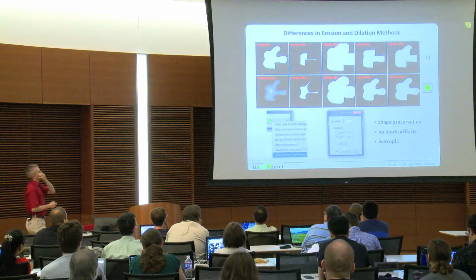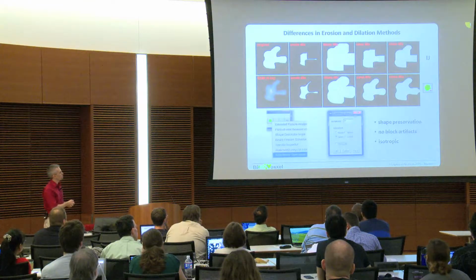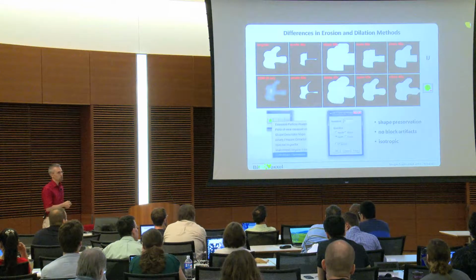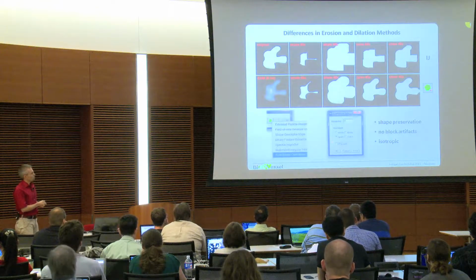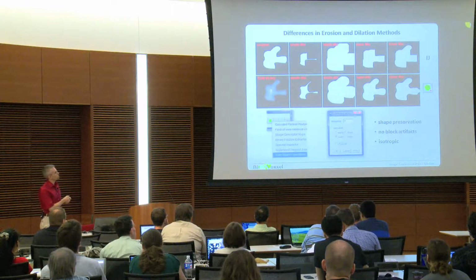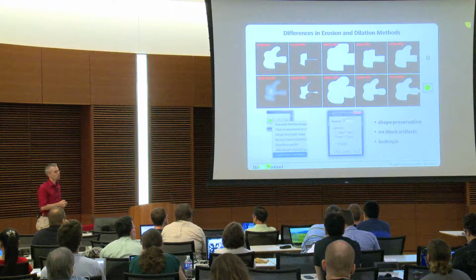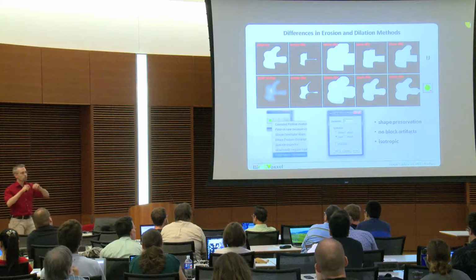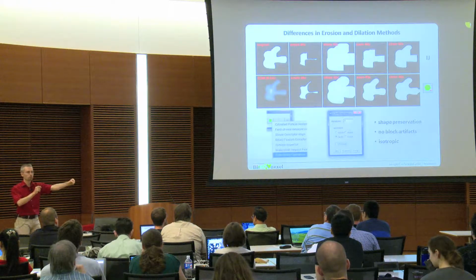And that is why I introduce here the function from the toolbox, which is called EDM binary operations. It has exactly the same options here with the nice radio buttons Wayne mentioned in the morning. So we have the option to choose one of those four, and this is based on the so-called Euclidean distance map, which is a transform which shows the distance from the pixels of your object to the background.